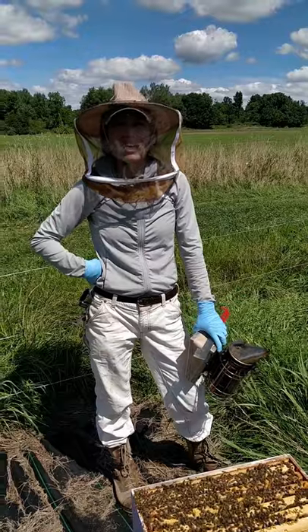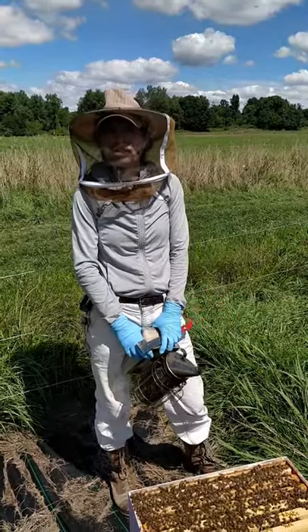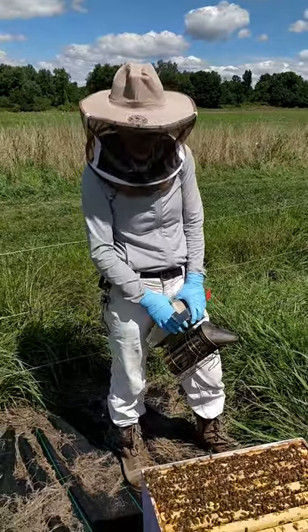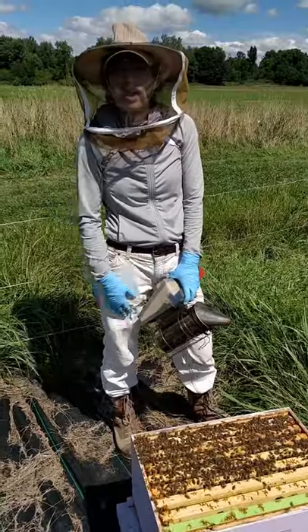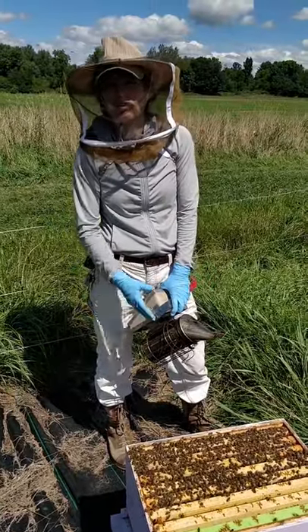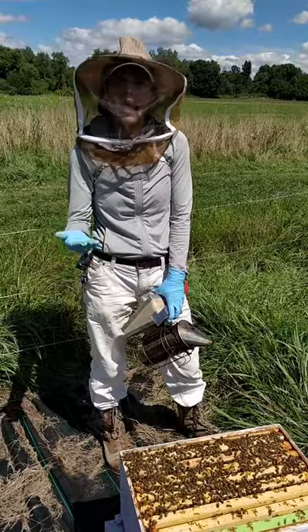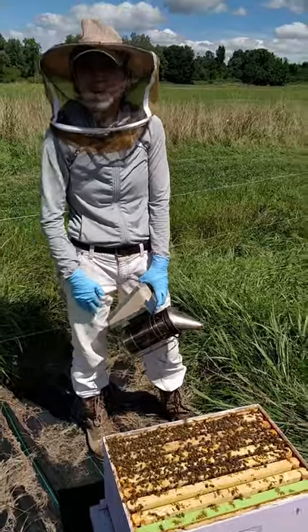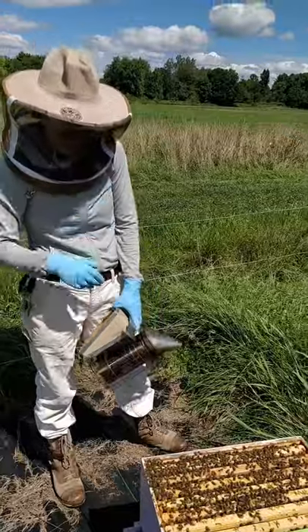Hi everybody, my name is Hannah Whitehead and I'm the Honey Bee Extension Educator at UMass Amherst. Today I'm going to show you how to do an alcohol wash. I've got this hive open here, down to the brood box. You want to do an alcohol wash because it's the most effective way to check for varroa mites, which you definitely have in your colonies. The question is how much? Doing the alcohol wash is the most effective way to see if you need to apply a treatment.